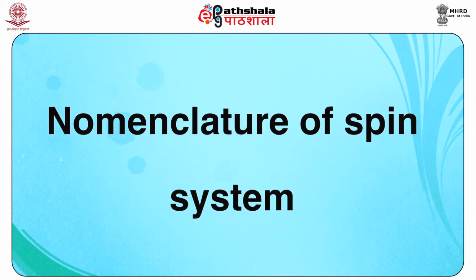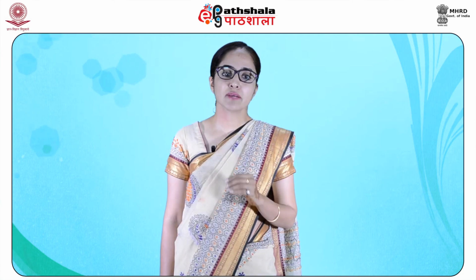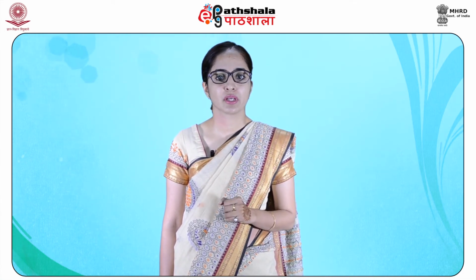Now, let us learn how the nomenclature of the spin system is done. A scientist named Pople developed a convenient method to designate the type of spin coupled systems. Each chemically different type of proton is assigned a letter of the alphabet like A, B, C and so on.